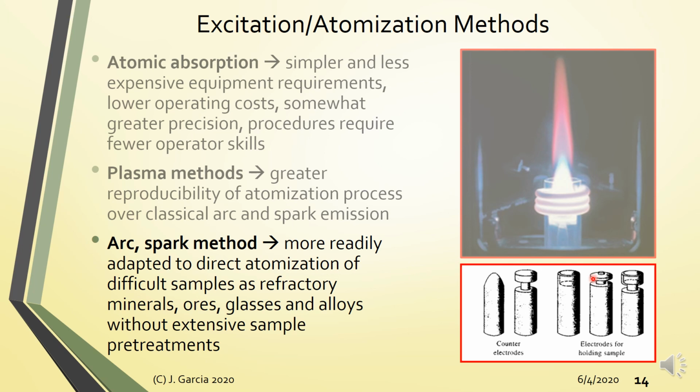The temperature can reach greater than 10,000 degrees centigrade, the temperature of the electrical spark itself, and this directly atomizes your sample. This is very useful for the analysis of refractory minerals, ores, glasses, and alloys without the need for extensive sample pretreatments. Okay, this is not quite common.